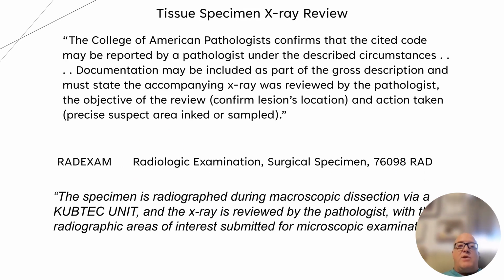So with this RAD exam code, you can actually charge, or get revenue, for doing a radiographic image of the mastectomy or lumpectomy case, and then uploading it into the LIS so the pathologist can see it, and then there's an associated charge. And a lot of places don't know you can do this.